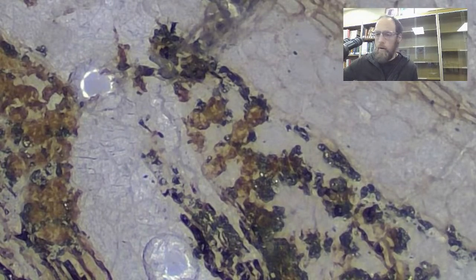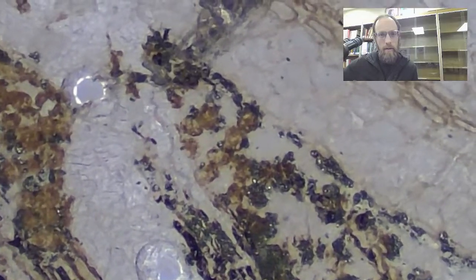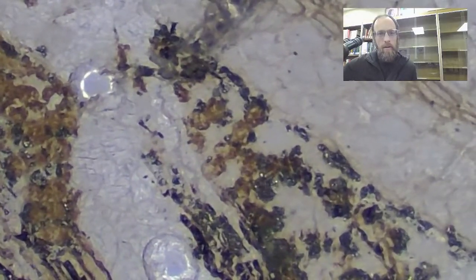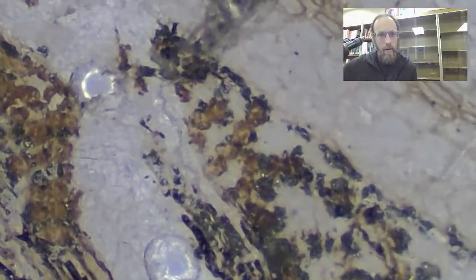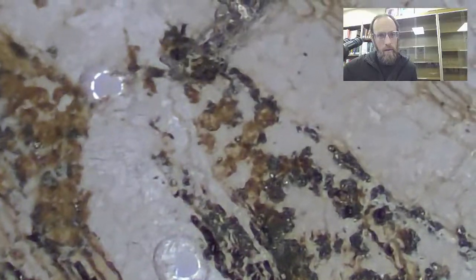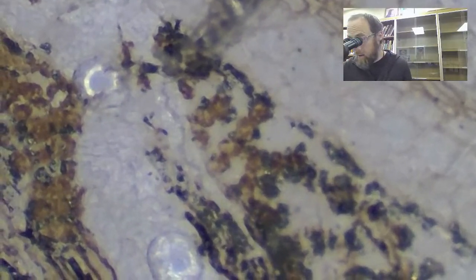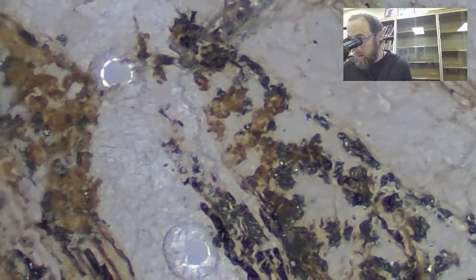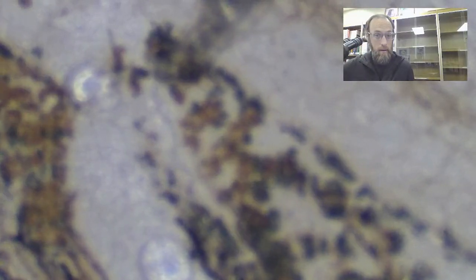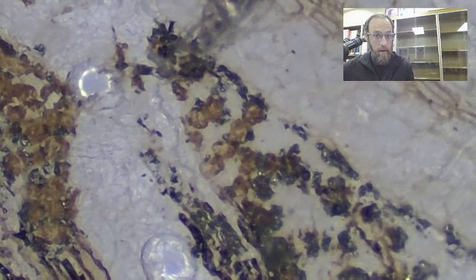I need to figure out a way to steady this camera a little bit more, because every time I touch it, it shakes, and that's not good for focusing. Okay. I need to put a wedge, I think, between the table and the stand.